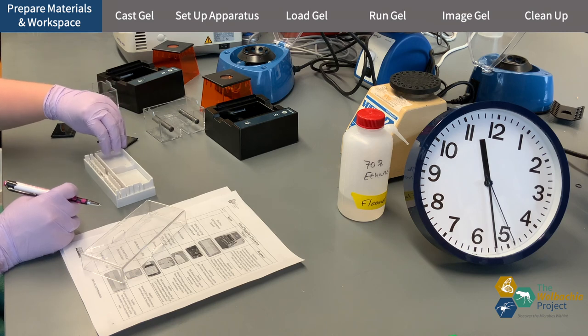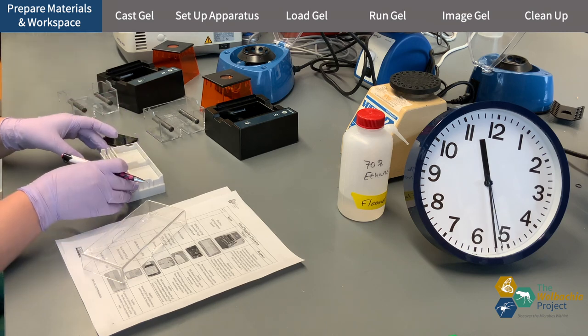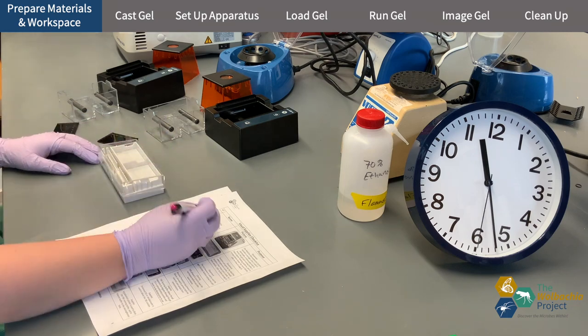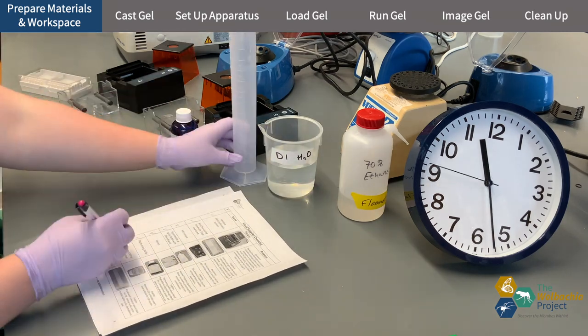If you're using Mini One we recommend using the 9-well comb which you can see in the casting setup. This comb will create the wells once the gel is set.